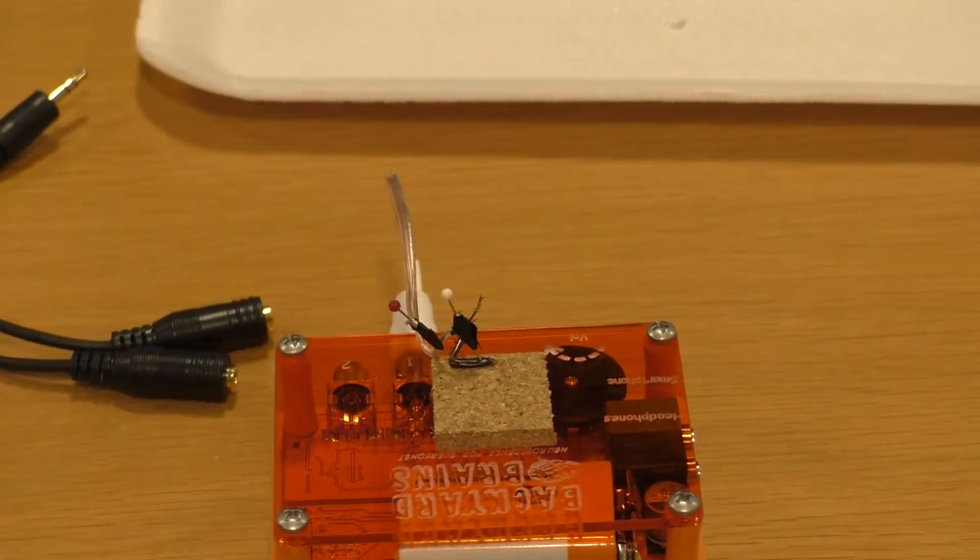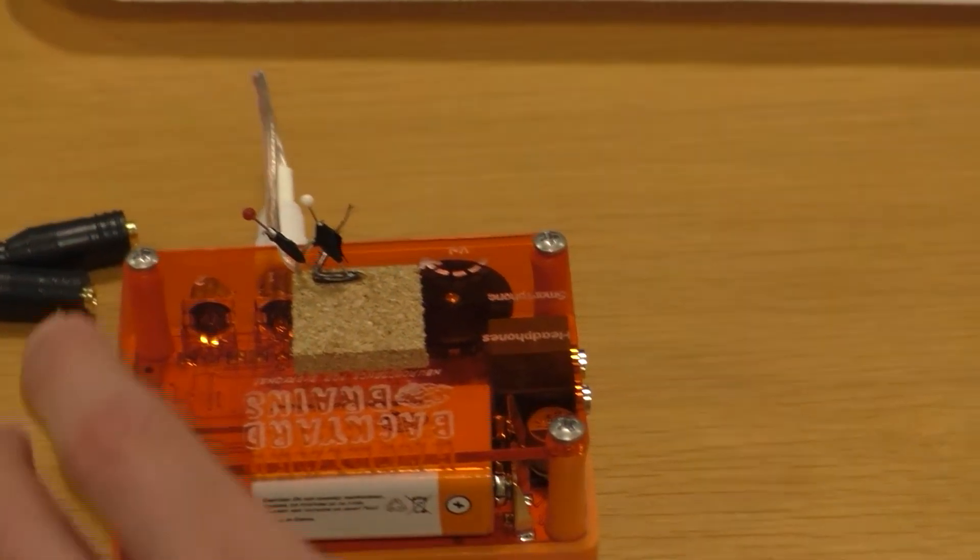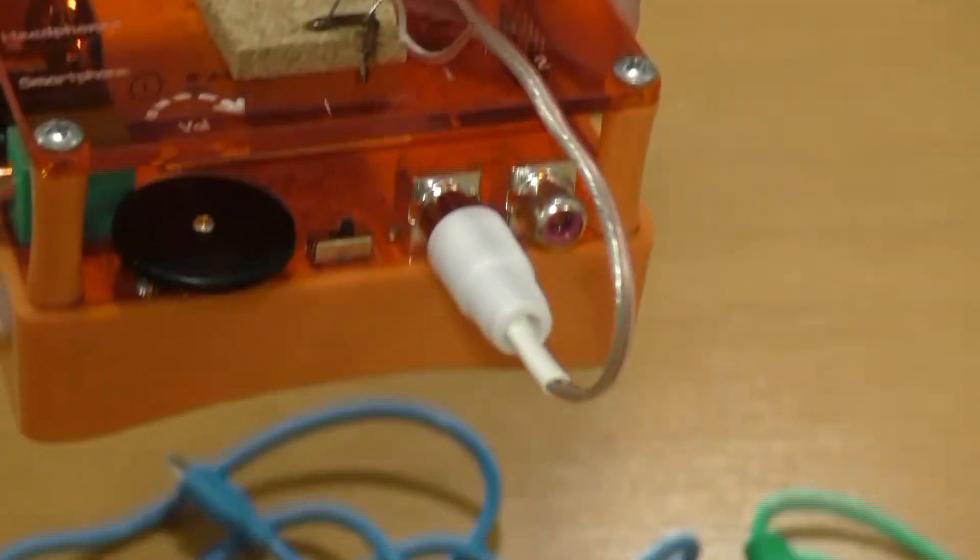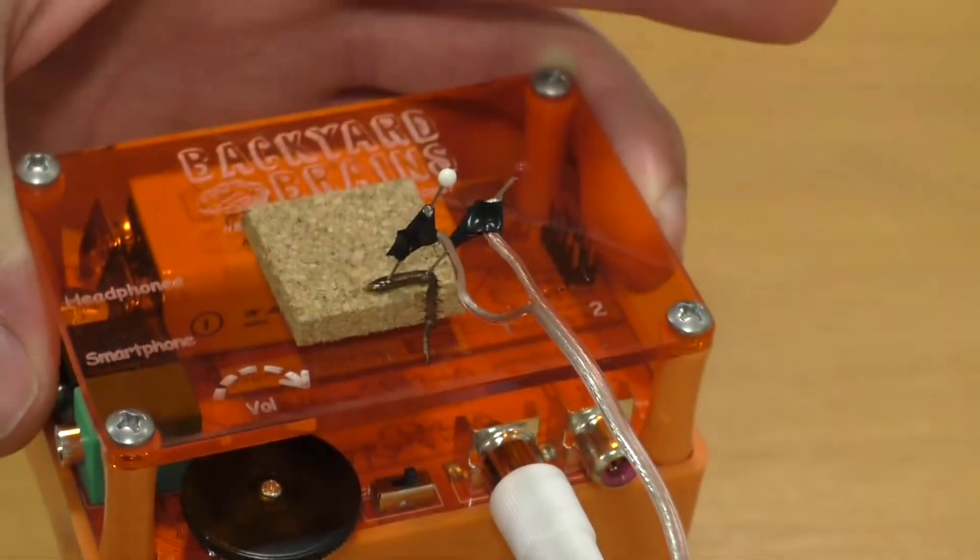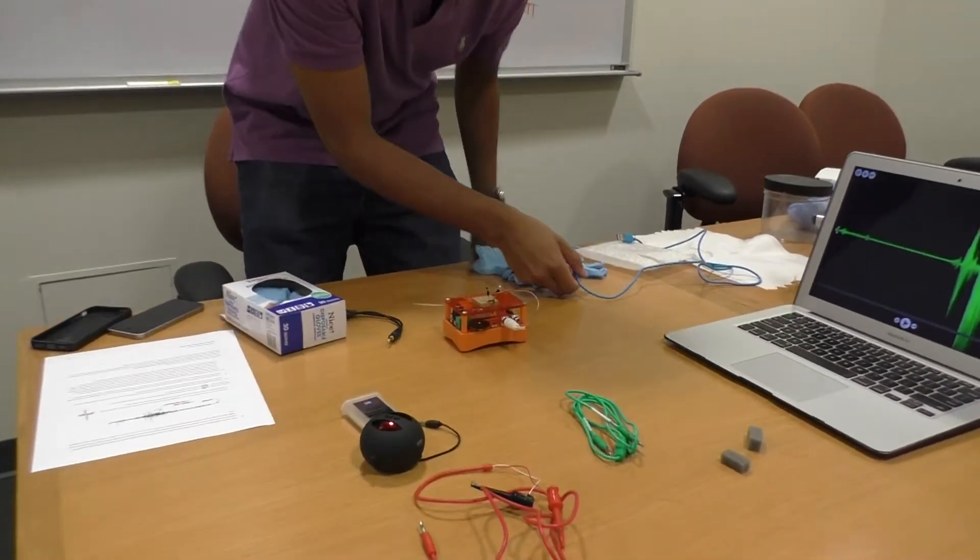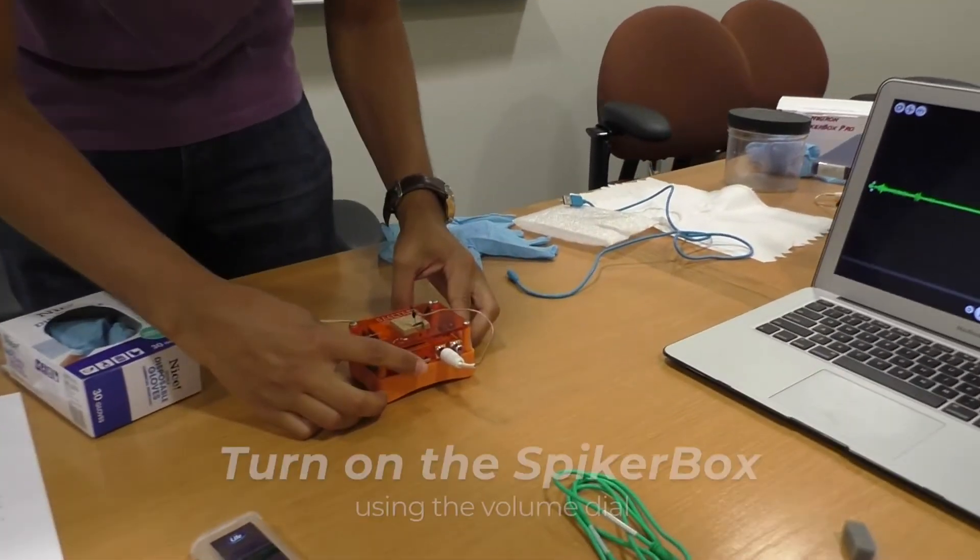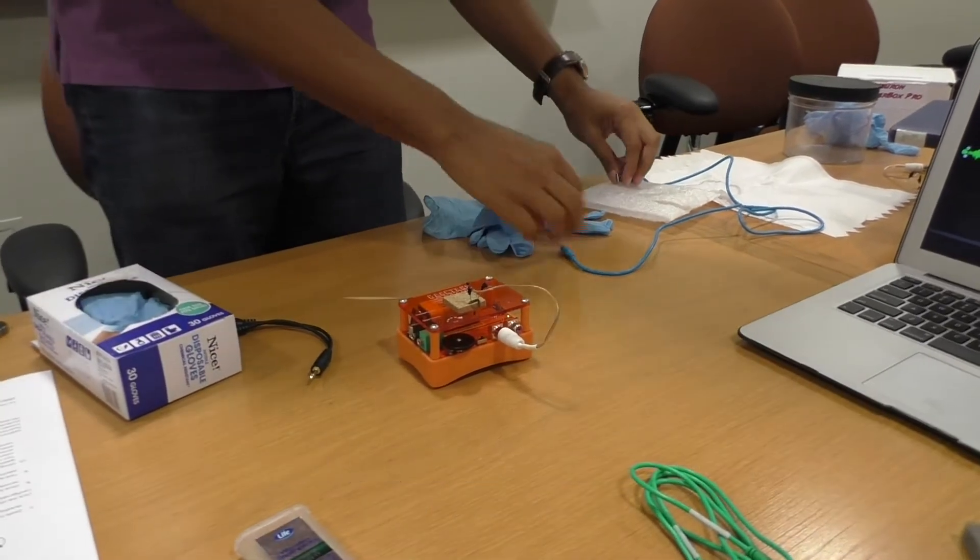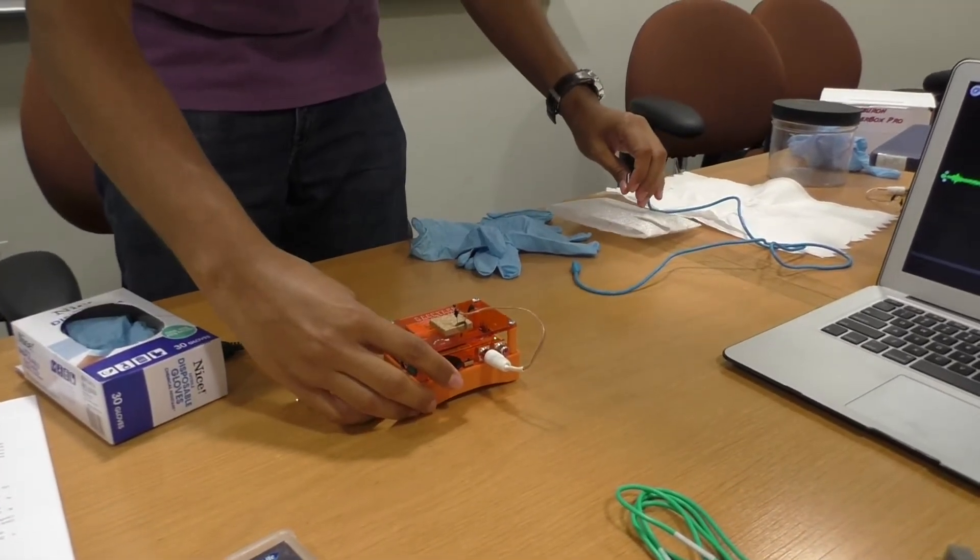Now that you're done setting up the leg itself, you can take off your gloves to do the additional parts of the experiment. So once the electrodes are attached to the leg of the cockroach, you're going to want to turn on the SpykerBox. You'll hear that sound. You can turn it up all the way.